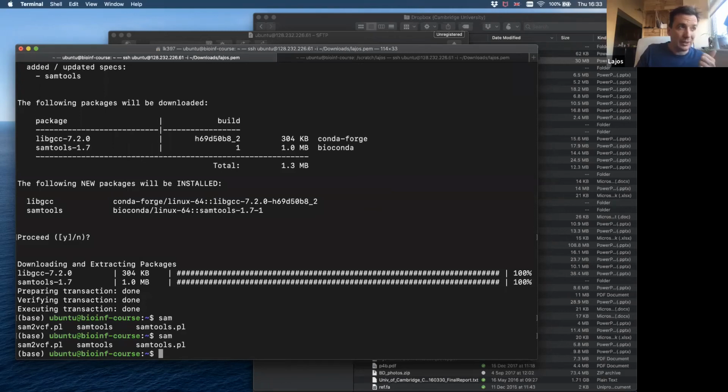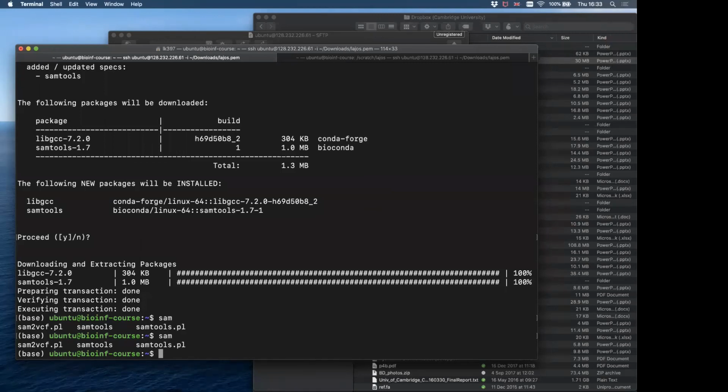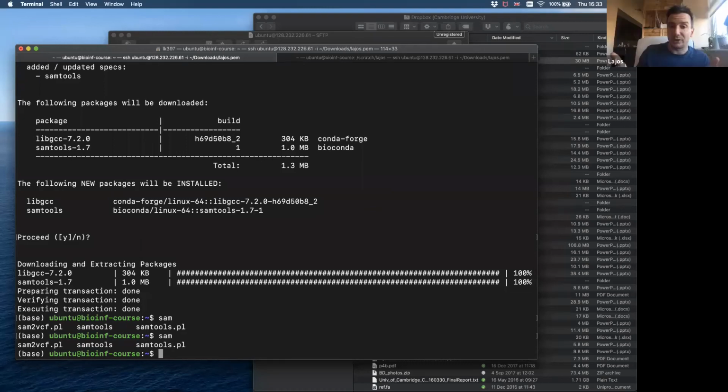I think it is not obligatory, but the reason why we are sorting the SAM file is that if it's sorted, the records will be in the order of their position. Now it is not in that order. Now it is in the order, I think, in which it was read in from the FASTQ files.